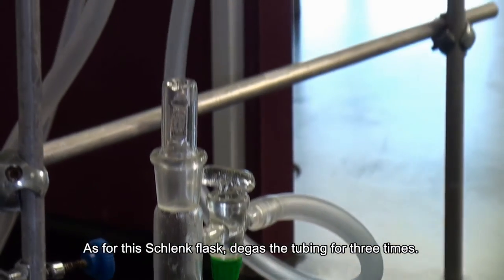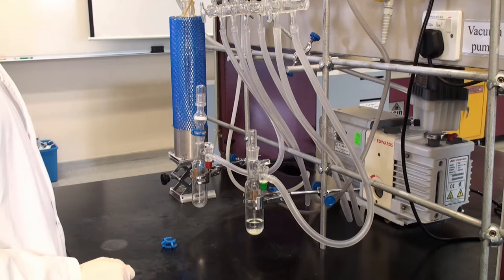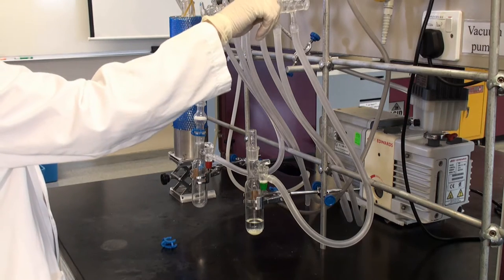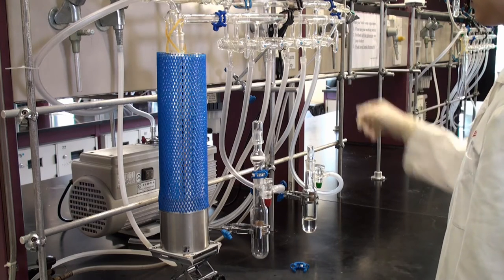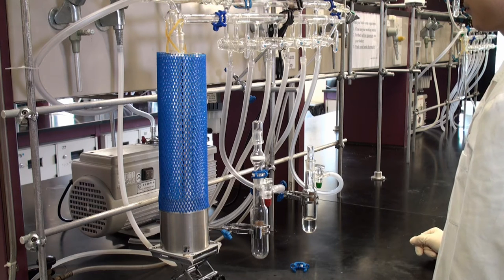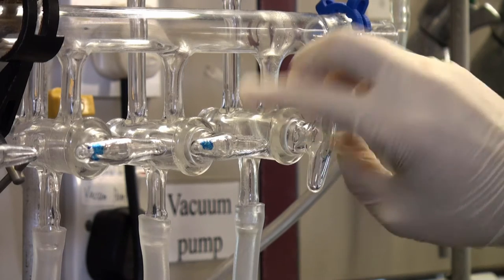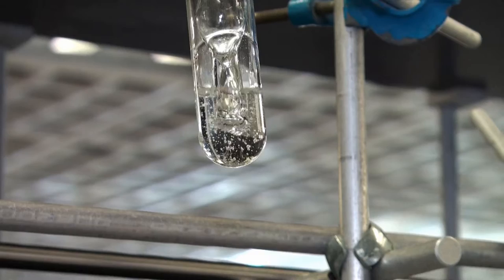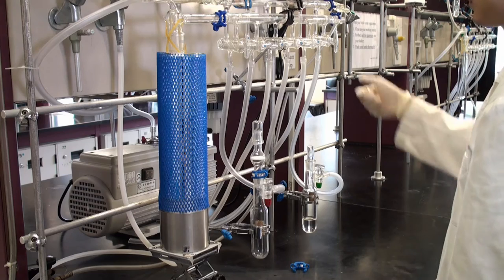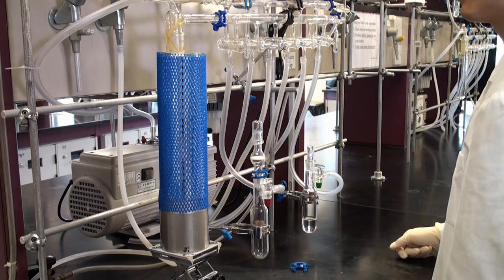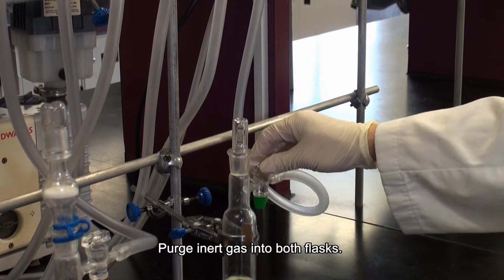As for this Schlenk flask, degas the tubing for three times. Purge inert gas into both flasks.